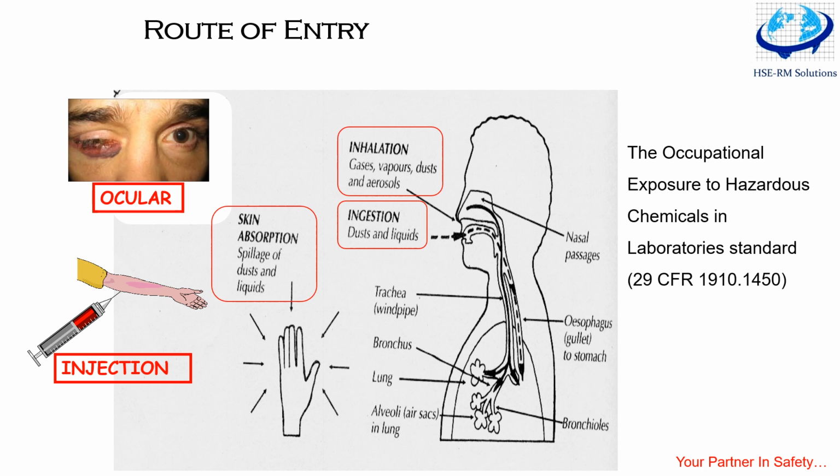The third aspect, and a much greater risk, is ingestion, when something goes directly into your mouth. What can go into your mouth? If your mouth is open, the dust, the liquids, small insects, everything can go inside your mouth. That is what we say, right? Usually, keep your mouth shut, or else something will go inside.